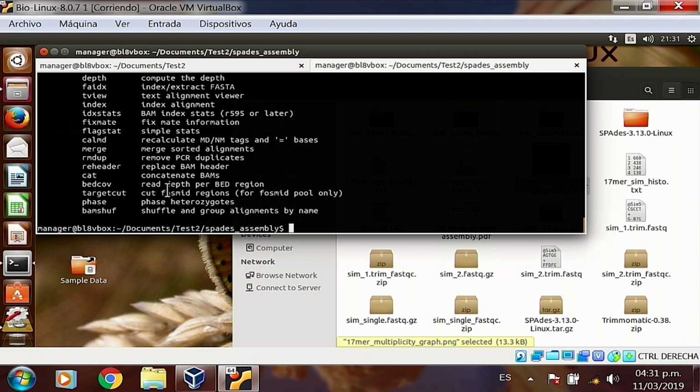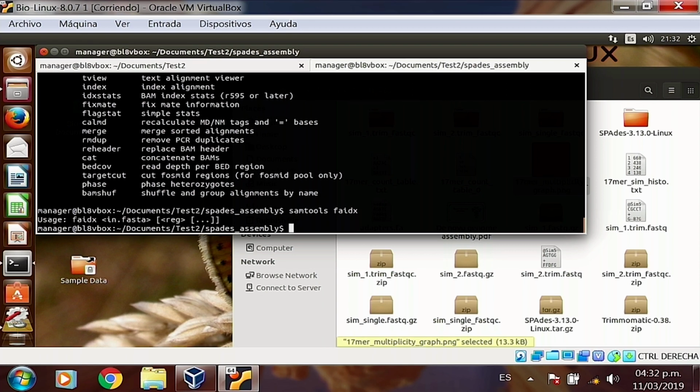So right now, the command we're going to be interested in is faidx. Faidx will generate an index and will gather basic information about the sequences that you've got. Why? Because since we want to grant it rapid access, it needs to know where each sequence starts, where each sequence ends, what's the total length of each sequence, that kind of basic output. So if we do this, samtools faidx, we have to give it a file, right? contigs.fasta.